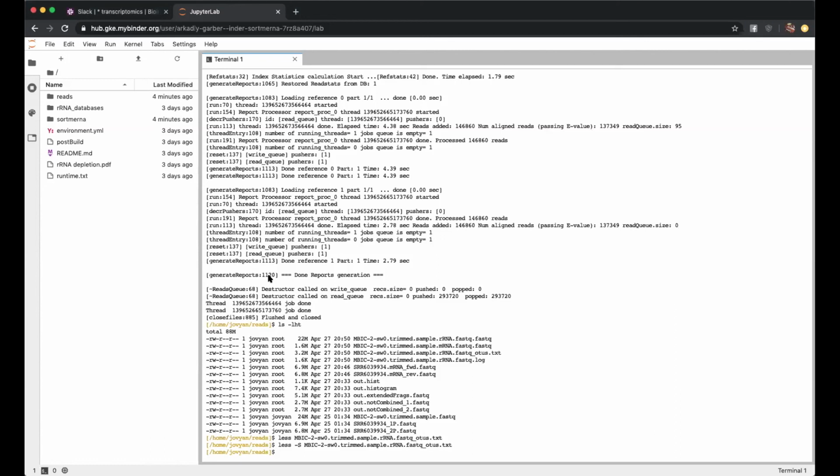So there have been significant changes that I haven't kept up with, but there was a time where you could decide whether you want a rRNA database, like a 16S rRNA database that is really big, that's clustered at the 97% level, or if you want a broader database with fewer sequences that are clustered at a 90% identity level. And that will determine how fast SortMeRNA runs.